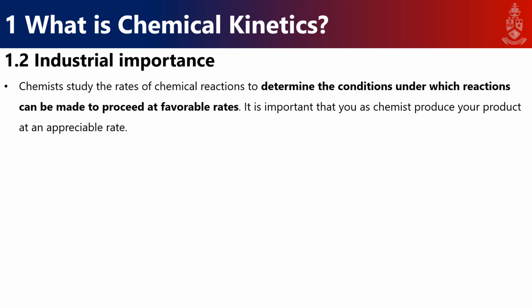Why do I want to study chemical kinetics? What is the industrial importance of studying the rates of chemical reactions? We study rates of chemical reactions to determine the conditions under which reactions can be made to proceed at favorable rates.